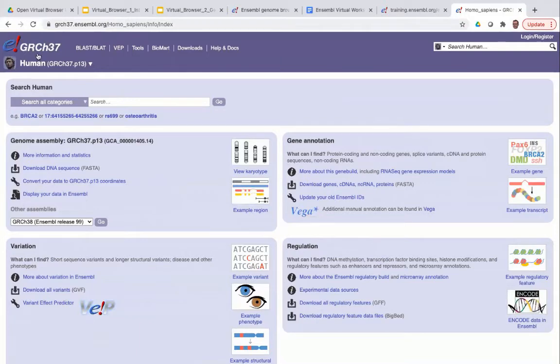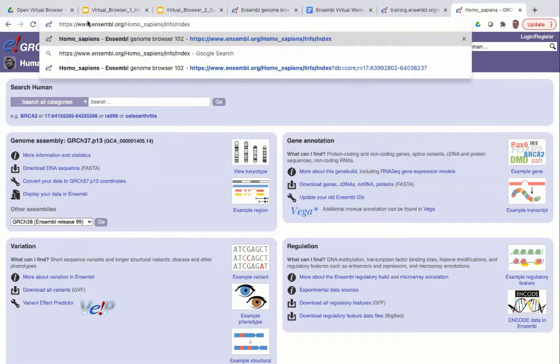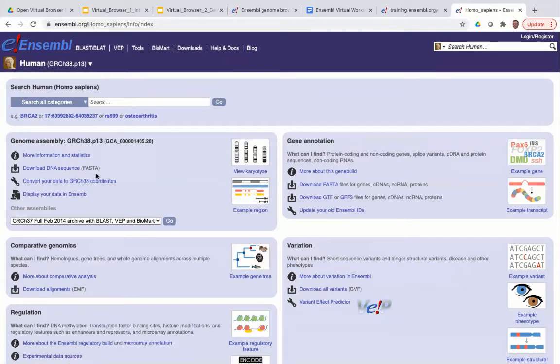You can see the logo at the top has changed to GRCh37 and the URL has changed to GRCh37.ensembl.org. Now if you search and navigate around Ensembl, you'll be retrieving data relating to the human GRCh37 genome assembly. To go back to the main homepage, just add www back into the URL prefix, which takes you back to the Ensembl homepage and the human species-specific homepage.